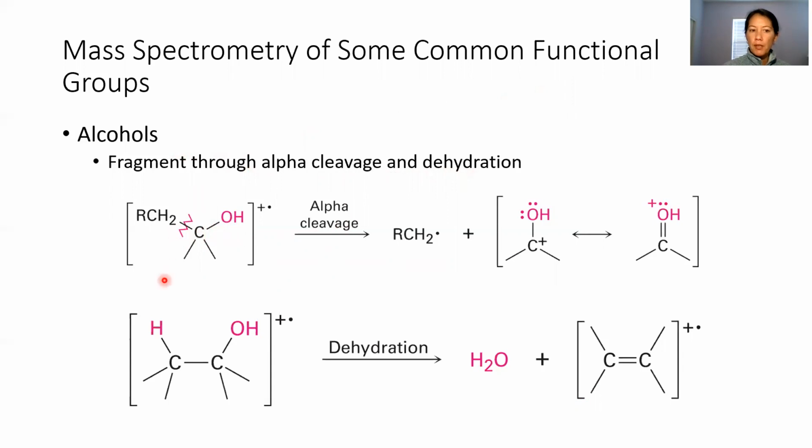So you could clip it here, and what you get left is this group as your cation portion. So this is good because this can also be stabilized by resonance, shown here. So if you see an alcohol, just know you could clip off one of the groups attached. And there may be different groups that you can. You can clip off a variety of different alpha substituents.